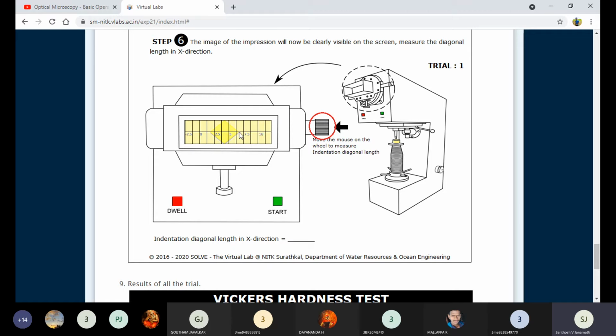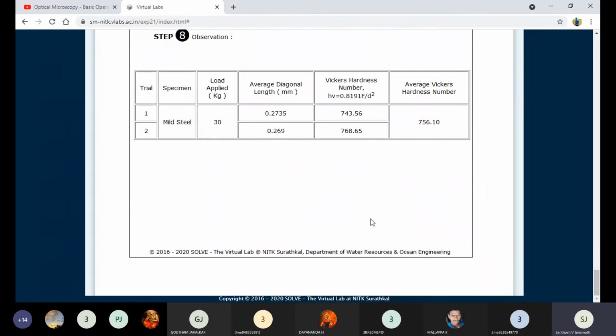And what about this end? Suppose this end touches here. Now you can count from here to here. If it is beyond this, you can count that also. This will be the half. So this is 3 and this is 3.5, like this, right? This is horizontal, one diagonal. Now if it is 3.5, you can note d1 is equal to 3.5.